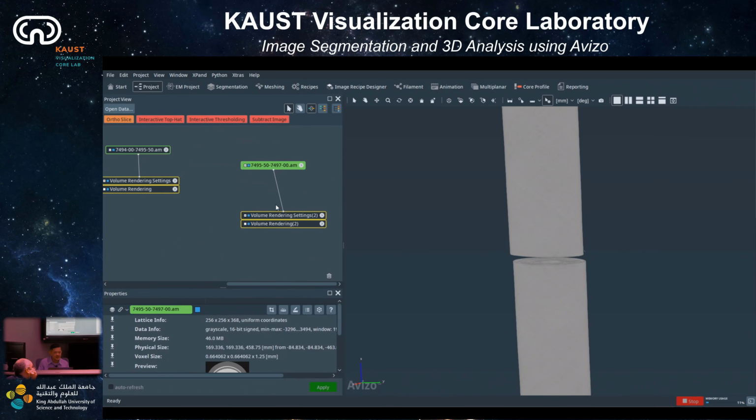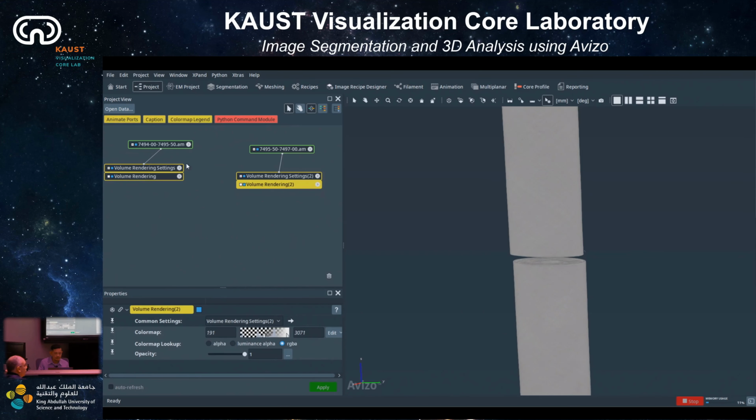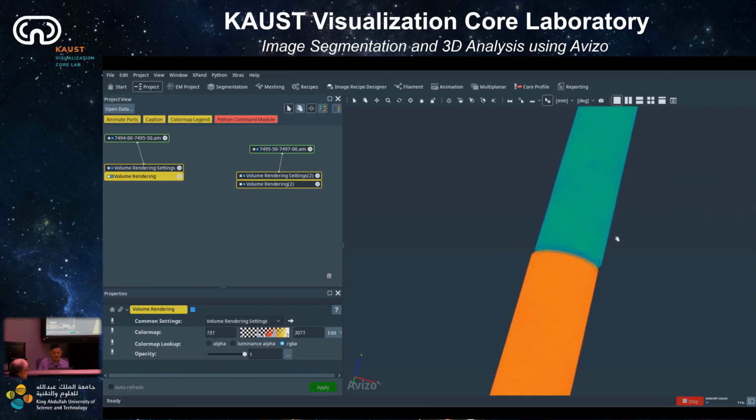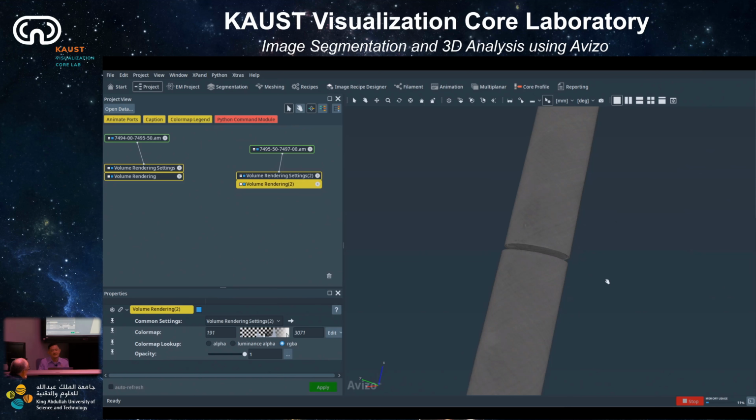So you can change color as well if you think it would help or whatever you like. For example, if you change this color to, let's say, green, and this one to orange, red. I don't know if that makes sense. It depends on the coordinate they had from the beginning. I think this is a fake thing that we just made a bit close to each other. We registered it to make it easier for you.